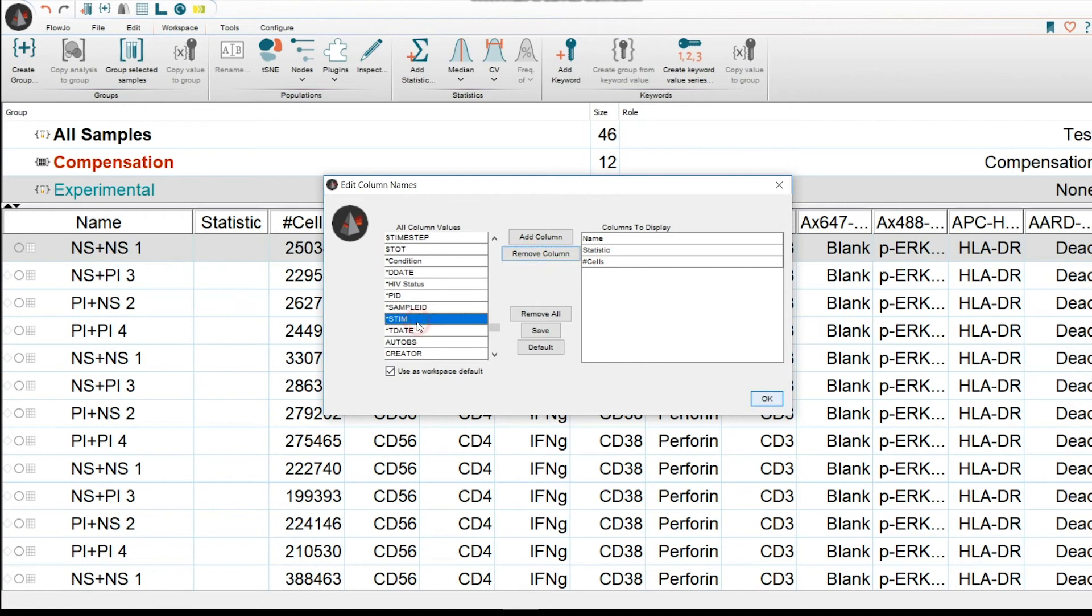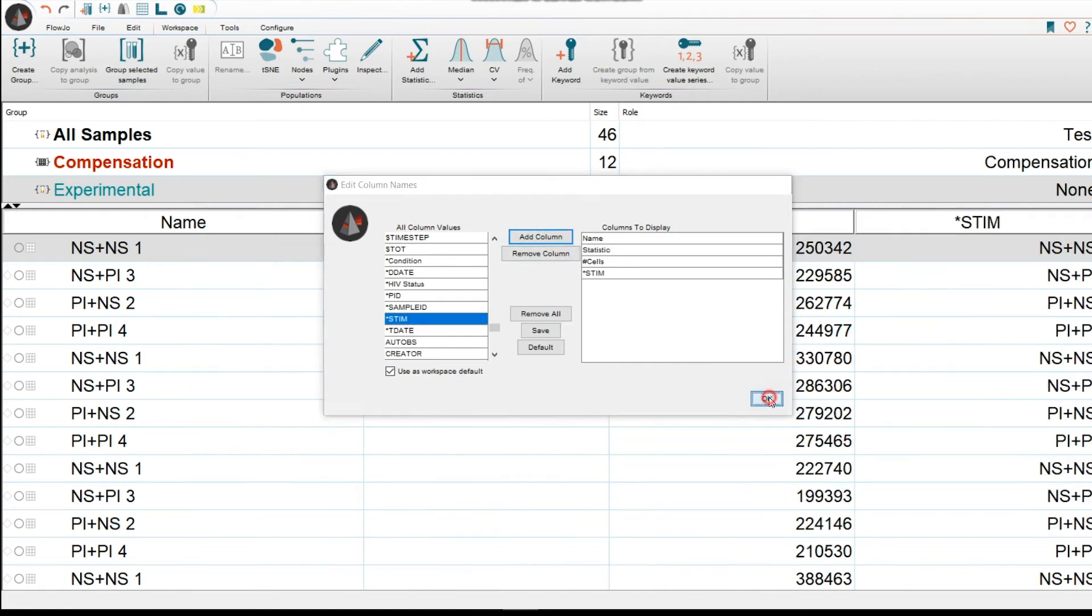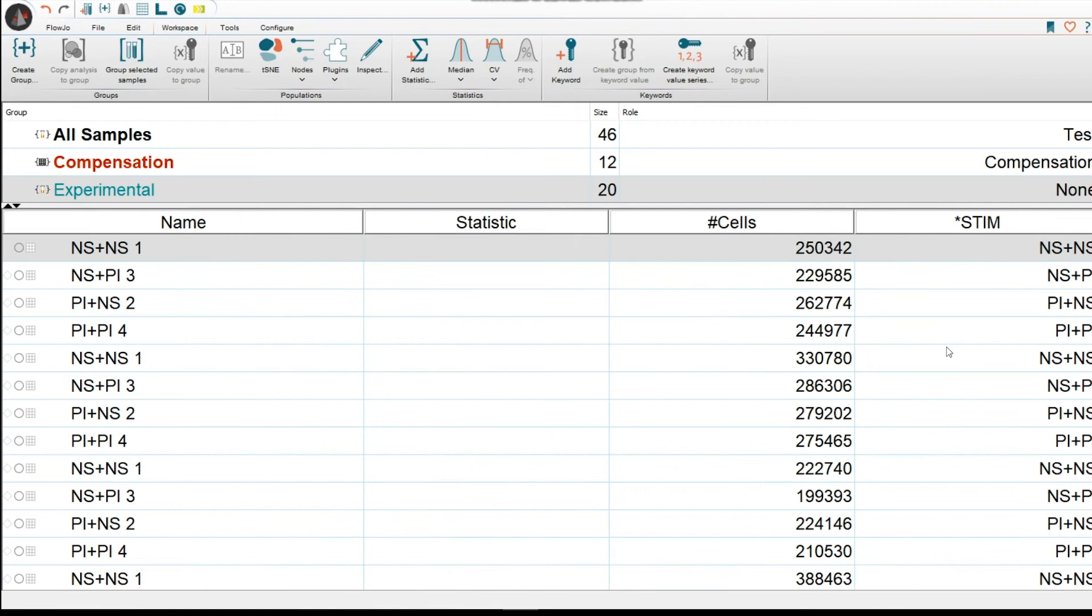So here, we're just going to select Stim. Then we're going to click on Add Column and click on OK. Now that's the keyword that shows up with its respective sub-keywords as NS-PI, PI-NS, and PI-PI respectively.